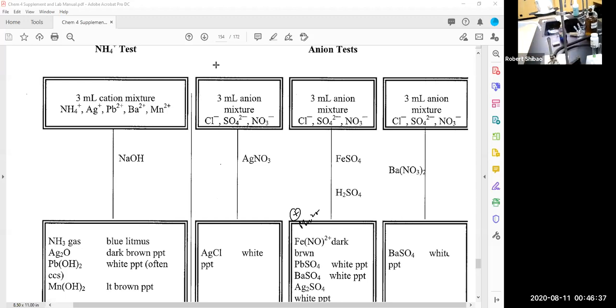So that's not very exciting because we got the exact same result. I was hoping for something different. But let's go back to this. Now take a look at how nicely coagulated our precipitate is. Do you see that? It's almost clear at the top.